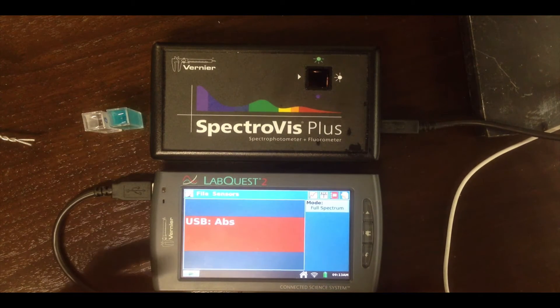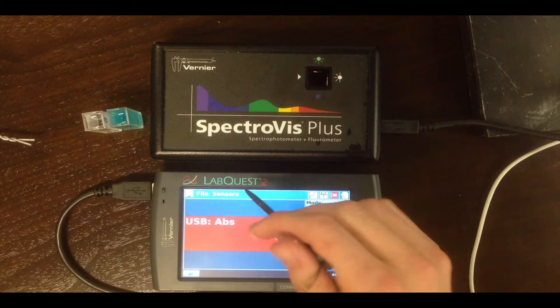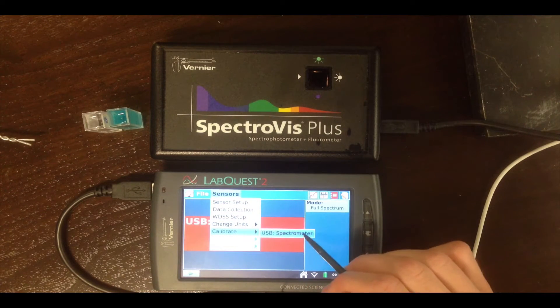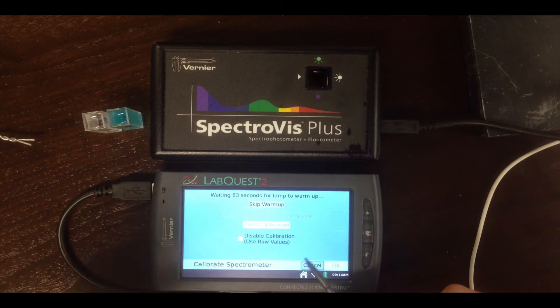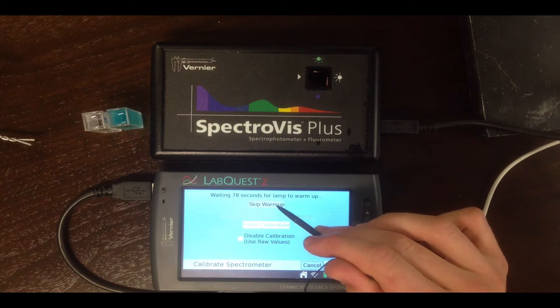Obtaining an absorbance spectrum is a two-step process. We have to first calibrate the spectrometer and then record the spectrum of the analyte of interest. To calibrate, go to Sensors, Calibrate, and choose the spectrometer instrument there. It's going to prompt you with a warm-up time. If you've had the spectrometer plugged in for a while, you can skip this — it just gives the lamp enough time to reach its equilibrium temperature and brightness.